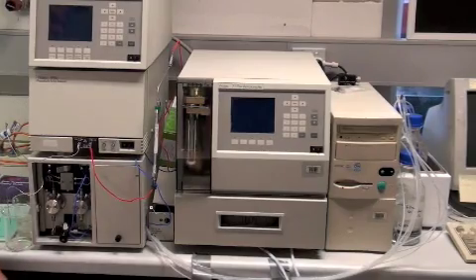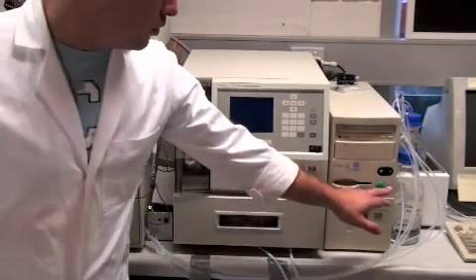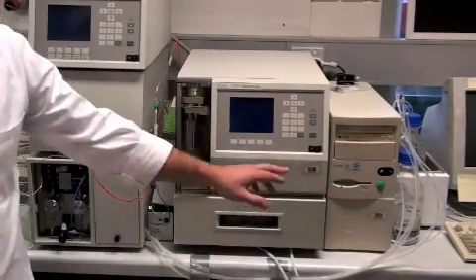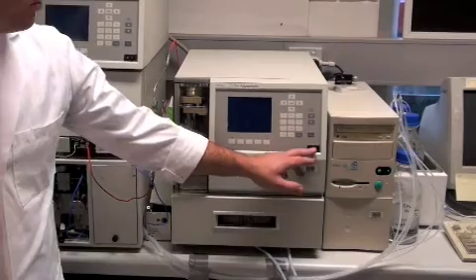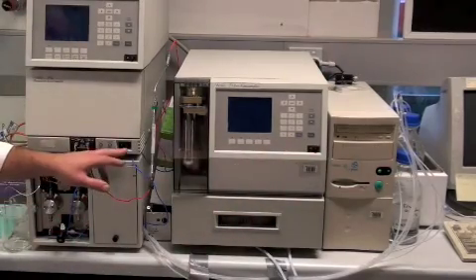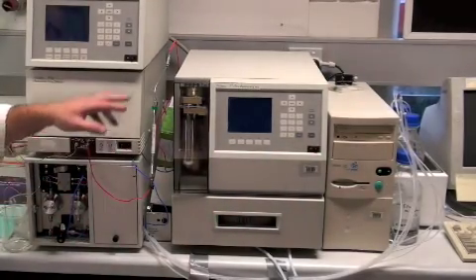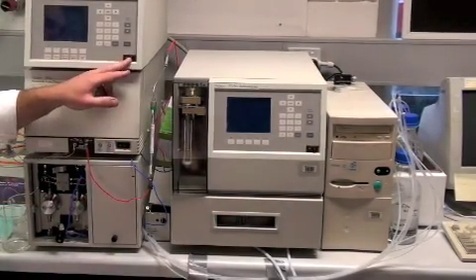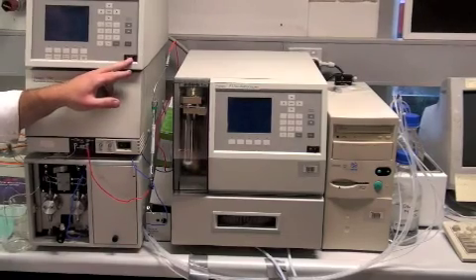The initial start-up procedure for this HPLC begins here at the computer with this button. It's then followed by the auto sampler with this switch. Then the photo diode array is turned on with this switch. And finally the controller, which controls the pump, is done with this switch.